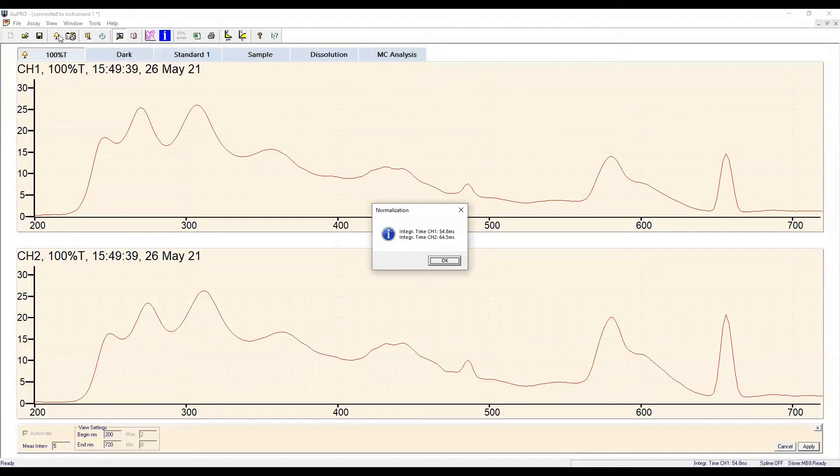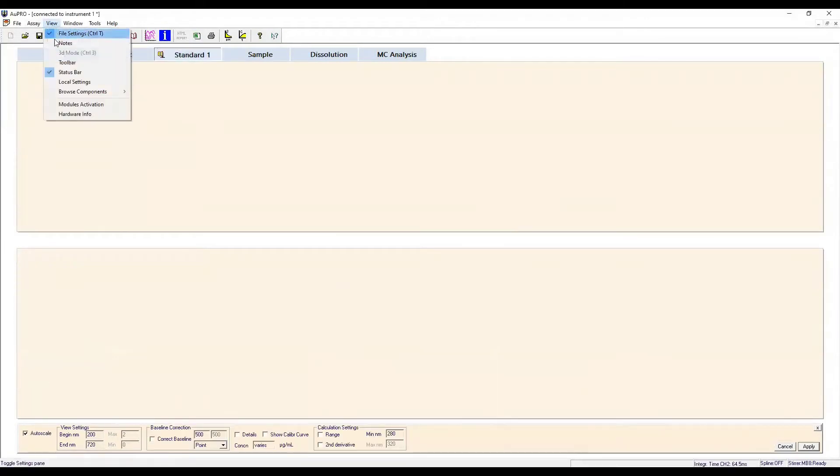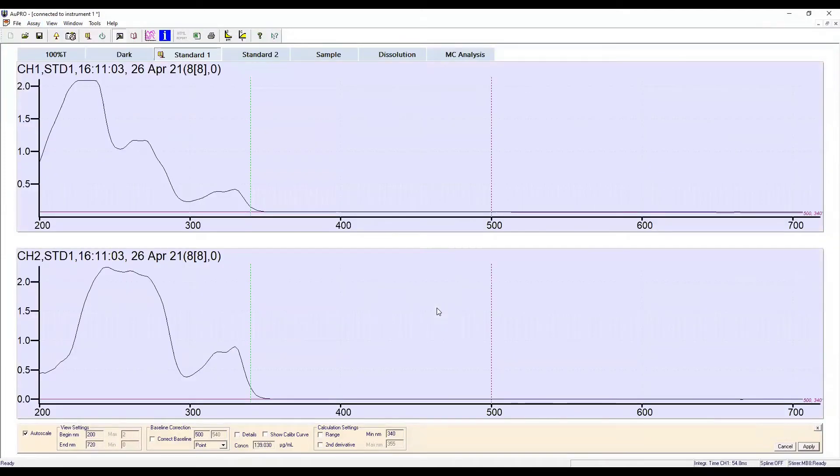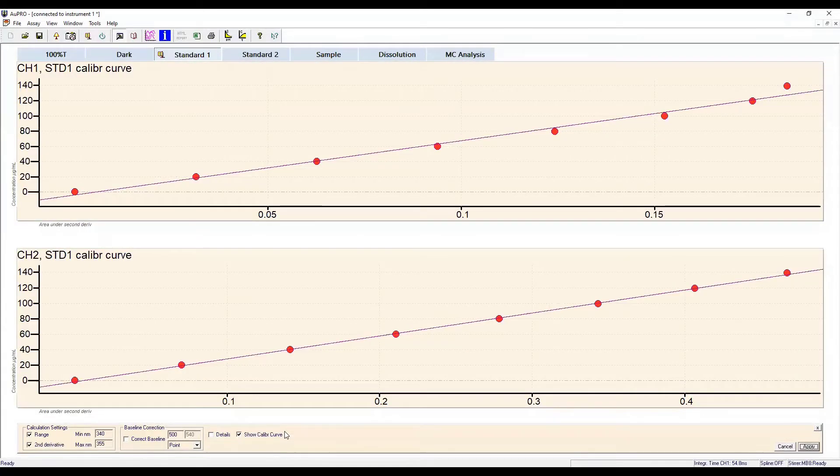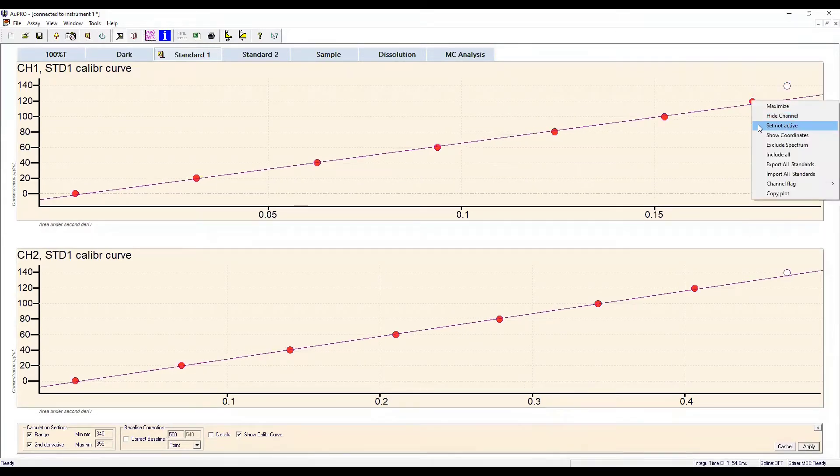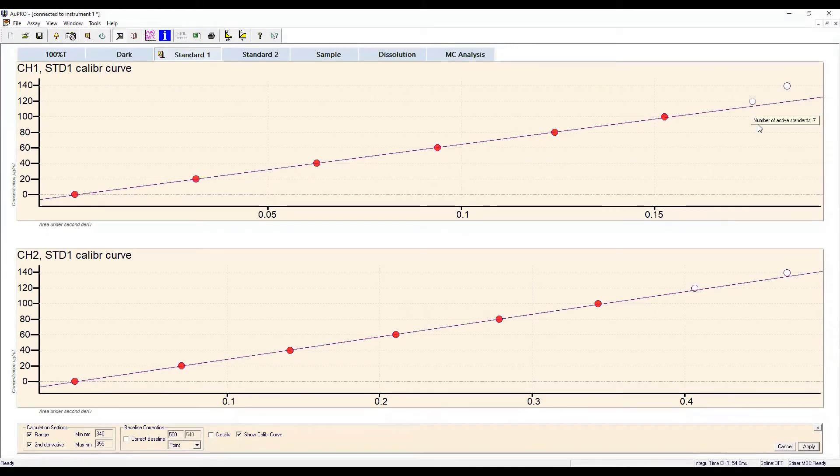Once the background is collected, previously collected standard spectra are imported. The spectra shown here are of naproxen. Channel 1 shows the spectrum and calibration of naproxen collected in pH 5 aqueous buffer. This will be used for our donor chamber. Channel 2 represents the sample in acceptor sink buffer and will be used to quantitate our acceptor chamber.